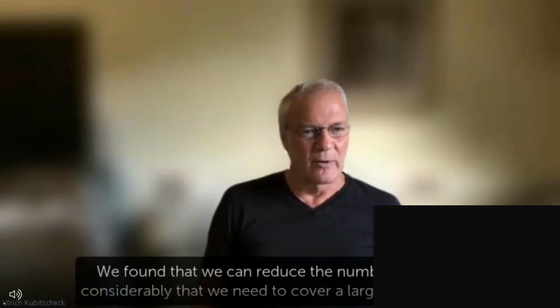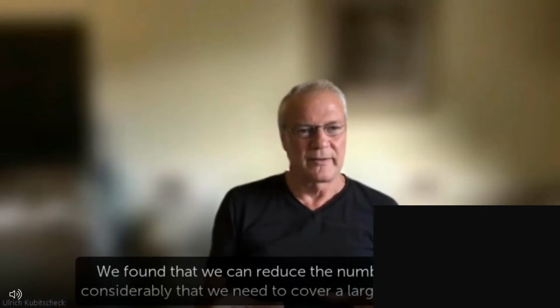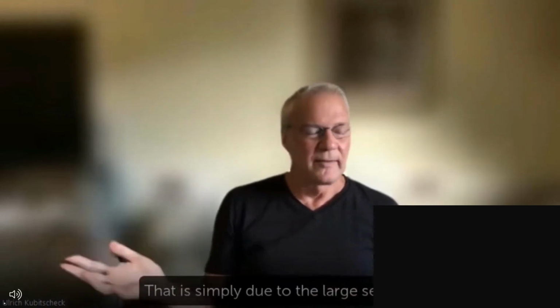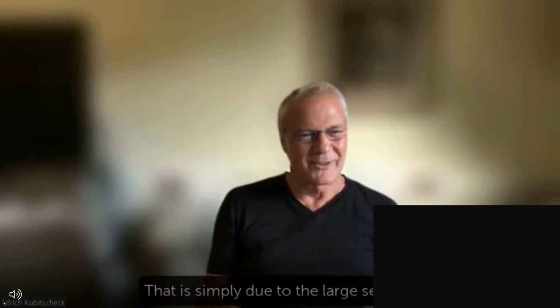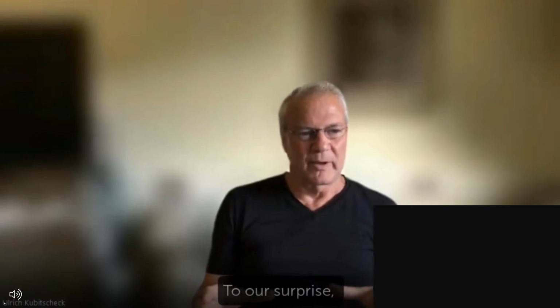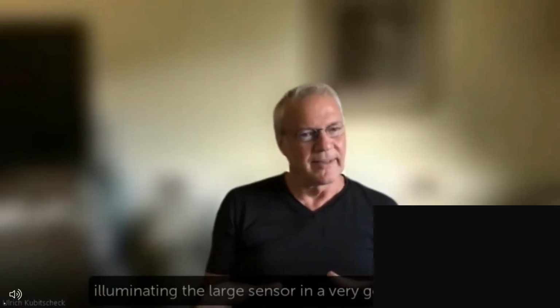And we found that we can reduce considerably the number of frames that we need to cover a large field of view. That is simply due to the large sensor. To our surprise, the microscope optics is also capable of illuminating the large sensor in a very good manner.